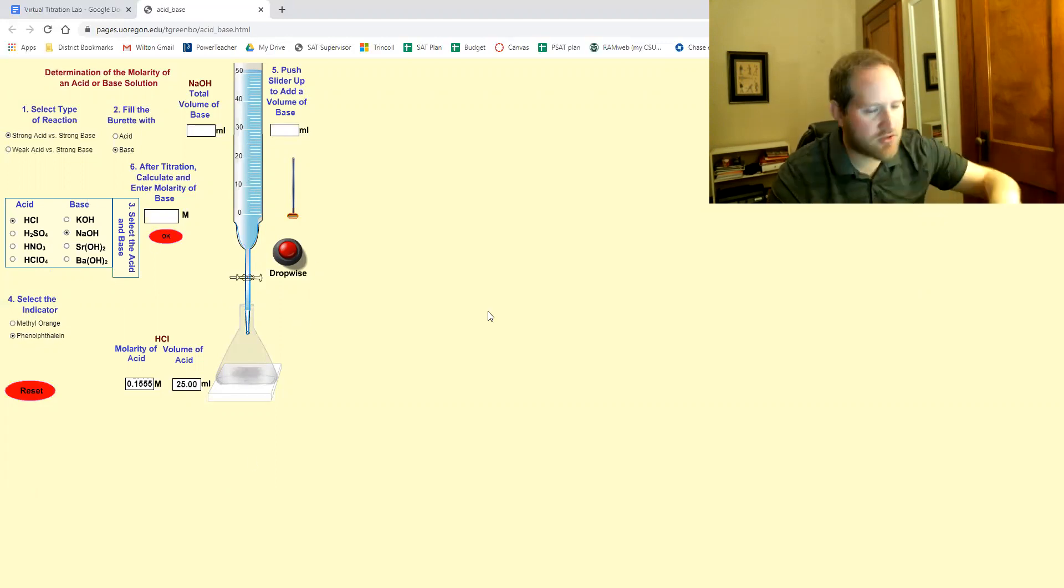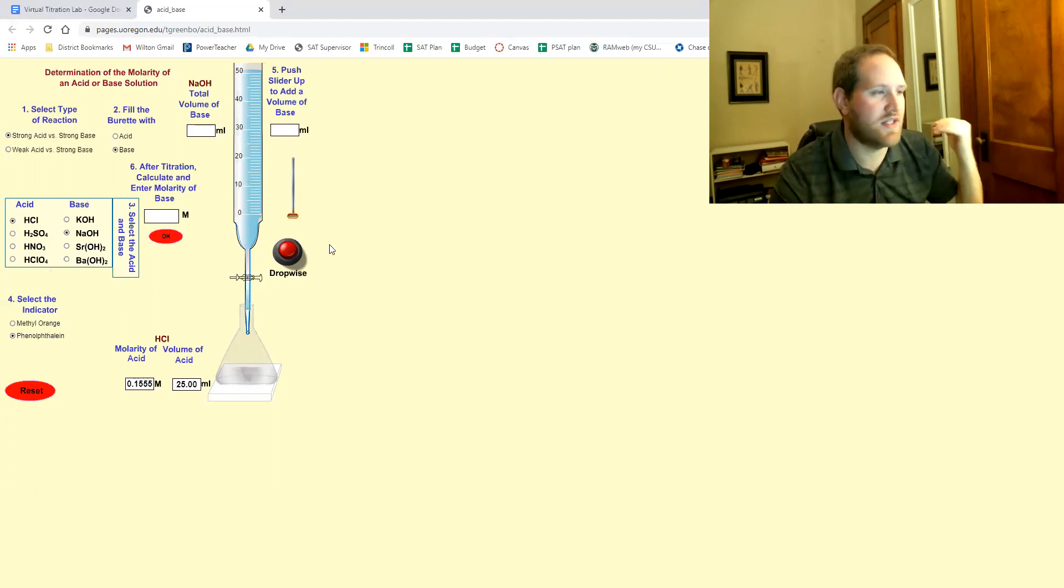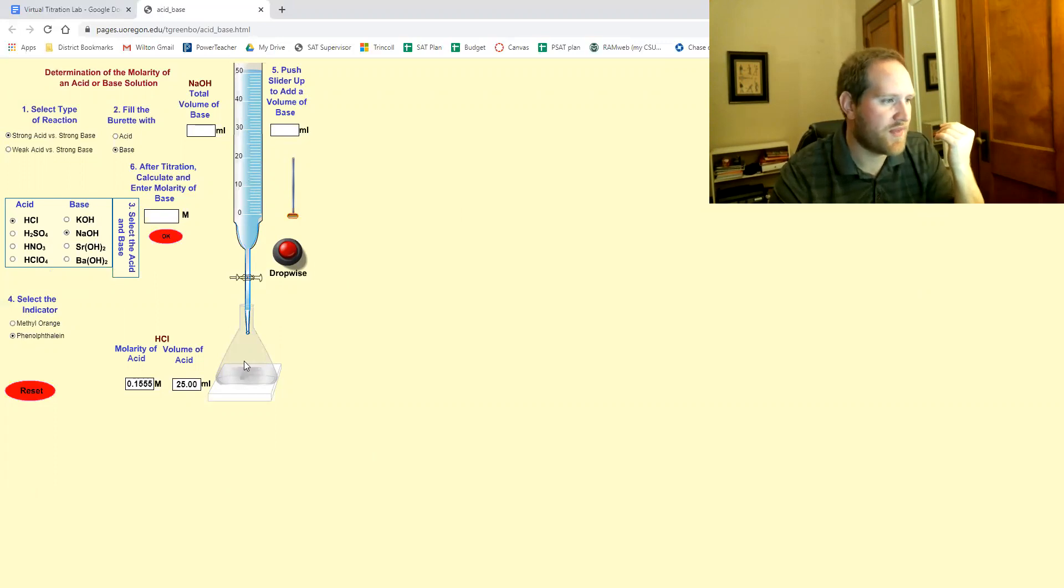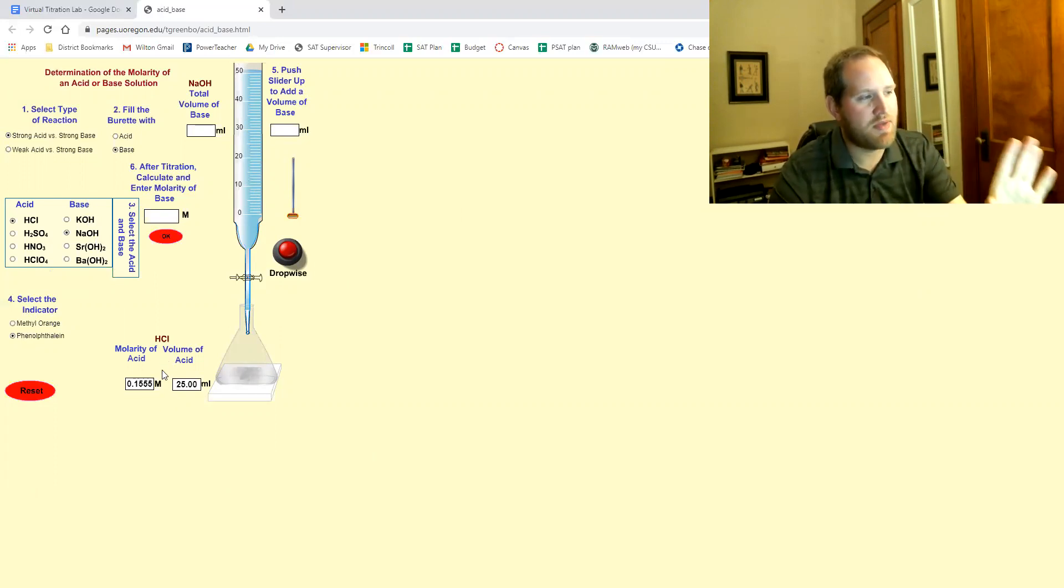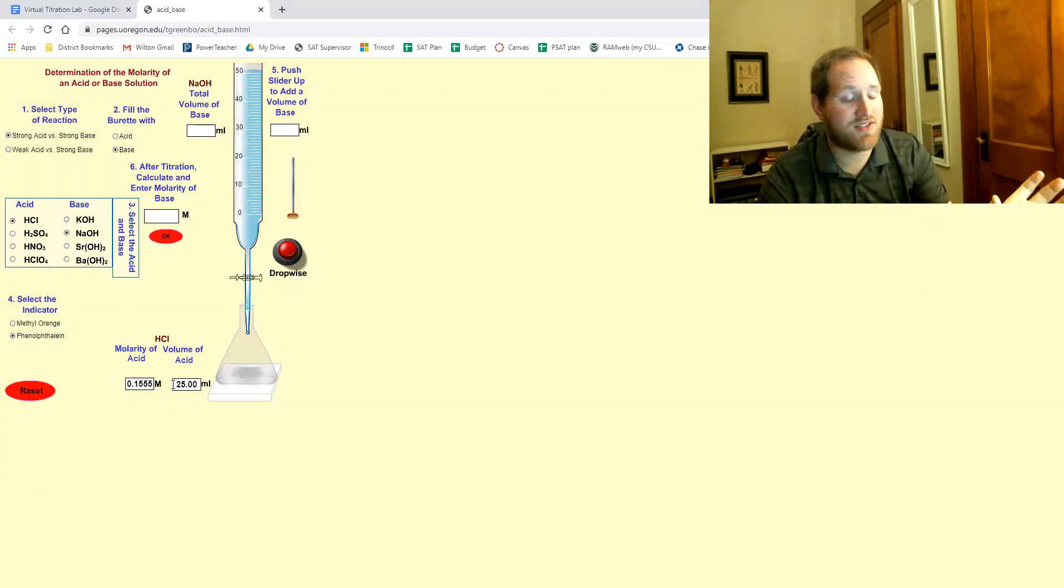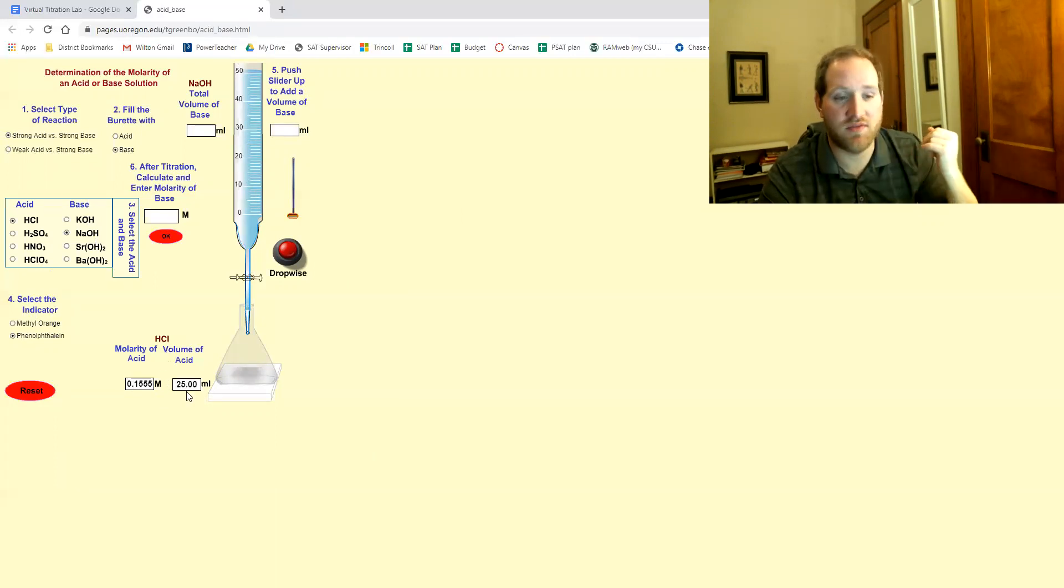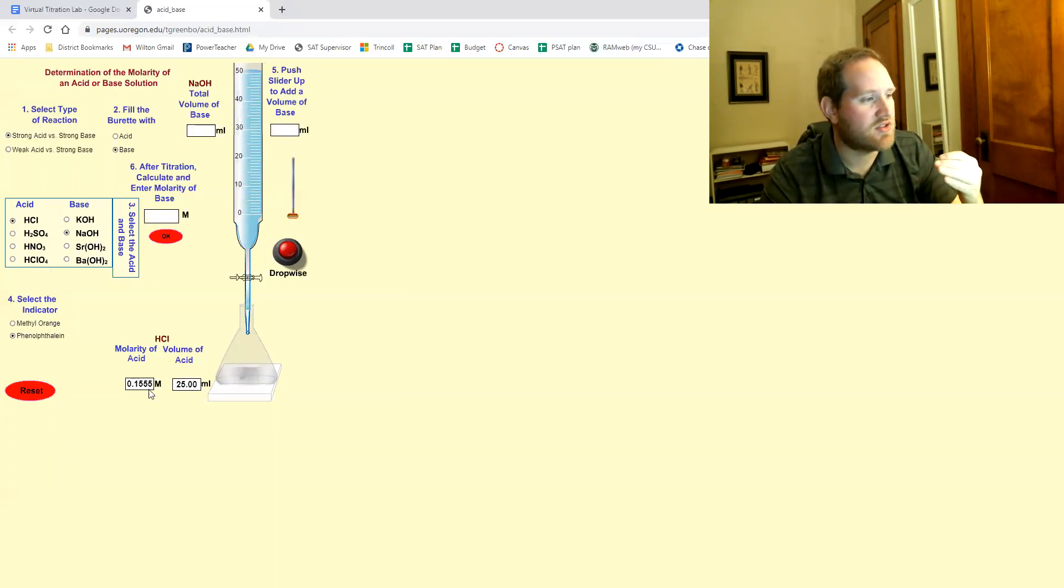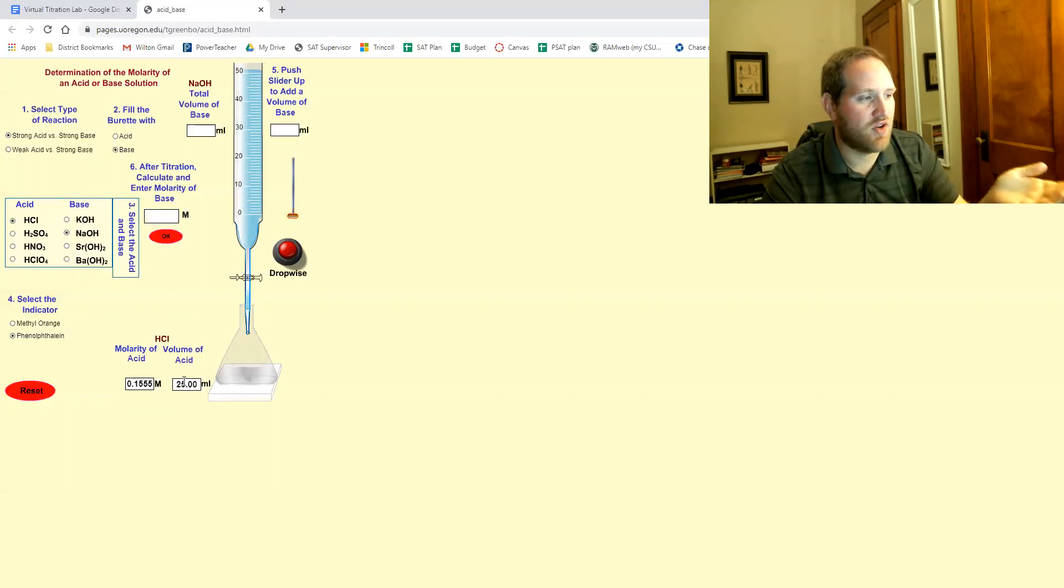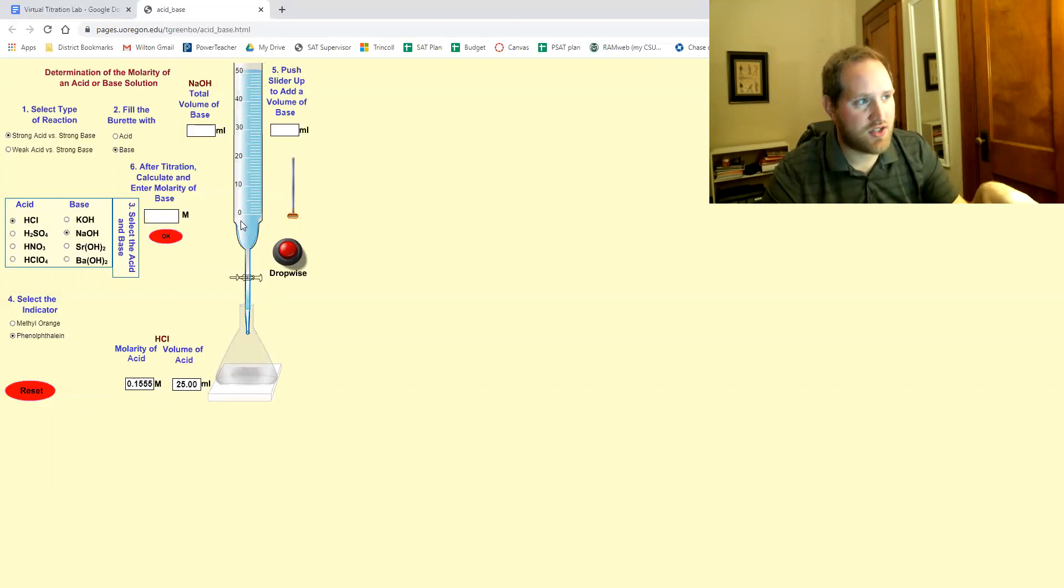Now let's make sure we understand what we're doing in this titration. Now in this titration it gives you, it basically means our acid is our known because it gave us both pieces of information about the acid. It gave us the molarity and it gave us the volume.